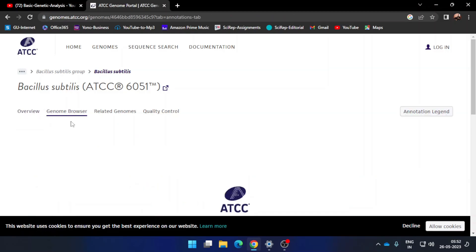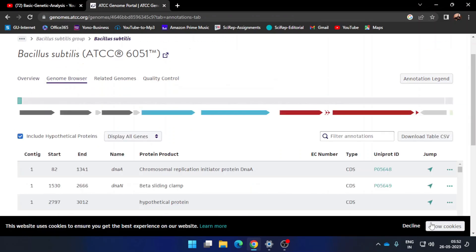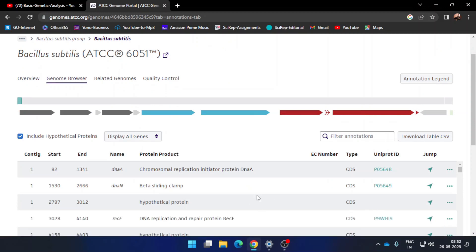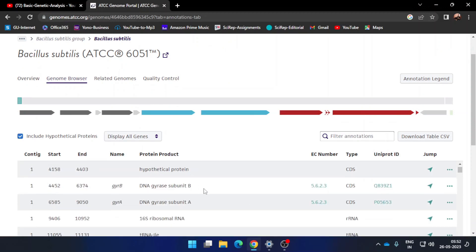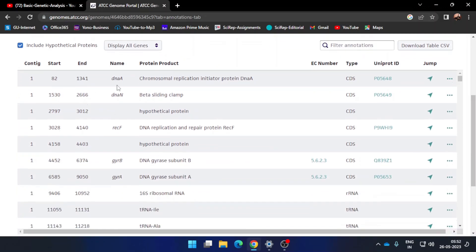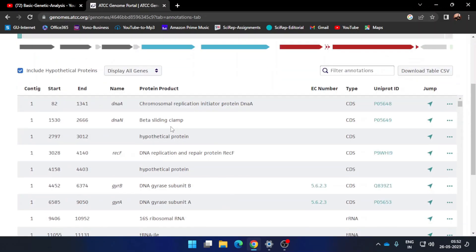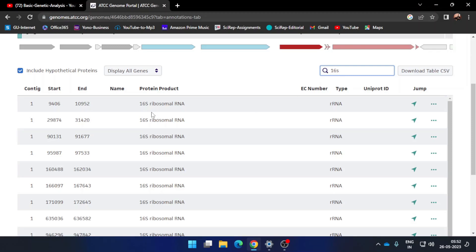Click on the Genome Browser option and a new page will open. Press 'Allow Cookies.' What you see here are the different genes of this bacterium. To retrieve the 16S rRNA gene sequence, go to the filter annotation search bar and simply type '16S.'